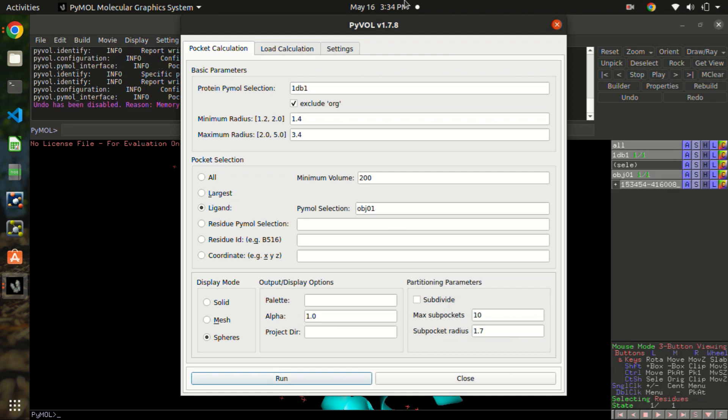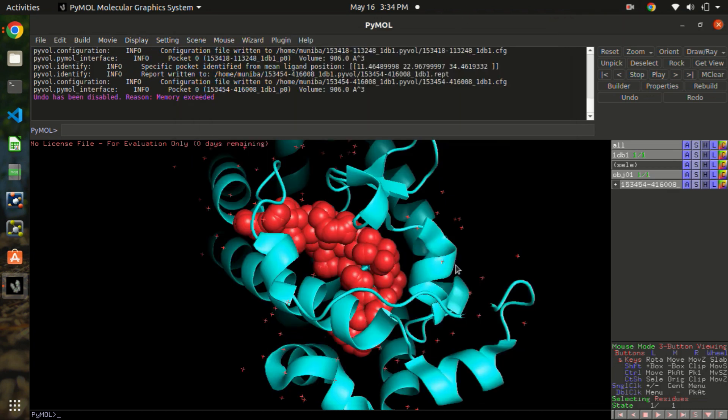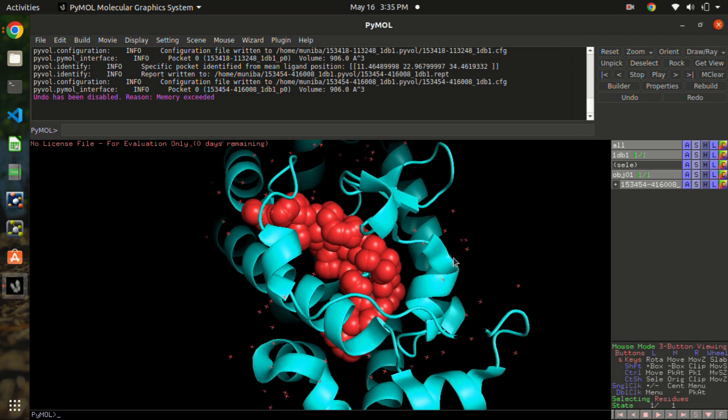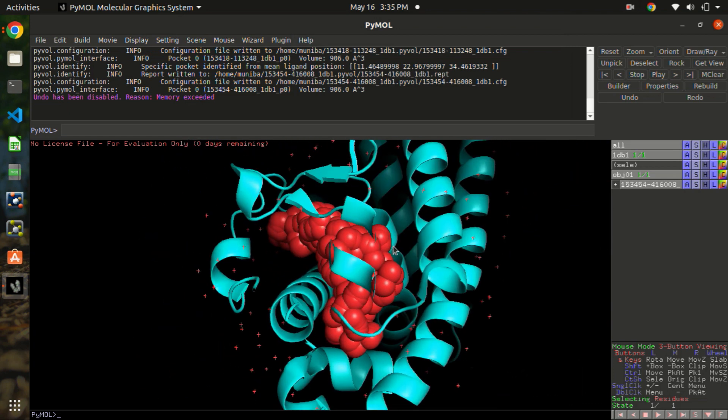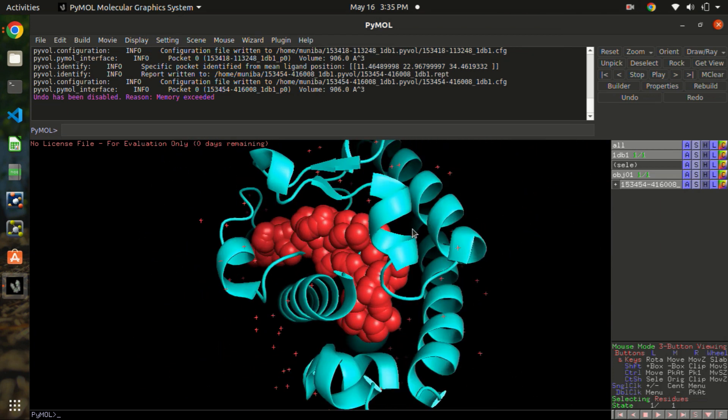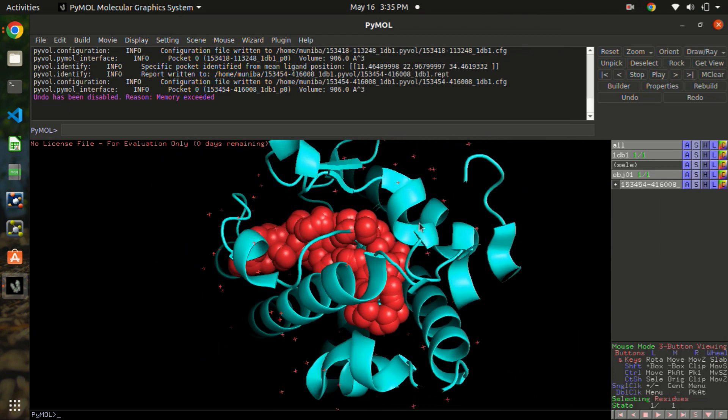Let's see what happens here. Now you can see the pocket and the spheres. Similarly, you can also change it to the mesh and these things.